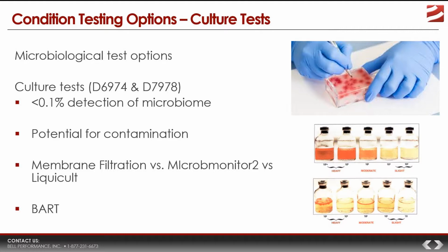What they do is they take a test sample, and by test sample we're talking about fuel that might have microbes in it, planktonic microbes. They filter it through a membrane that is actually filled or inoculated by culture medium. So it catches the microbes. The microbes stay there, and you incubate the membrane. You allow it to grow for a certain period of time, and so hopefully you get a picture of what's going on in your tank. So that's membrane filtration. That's the laboratory standard.